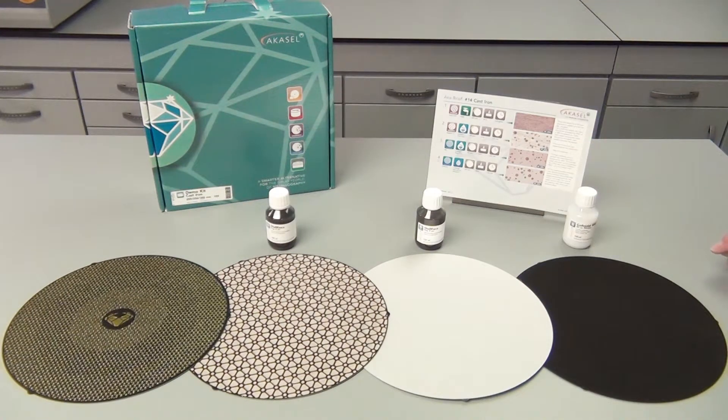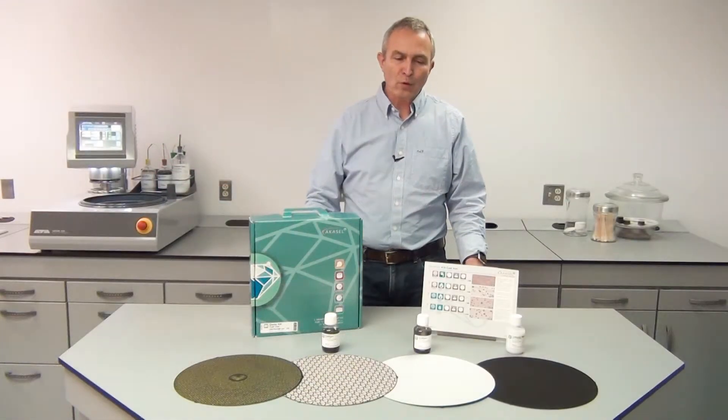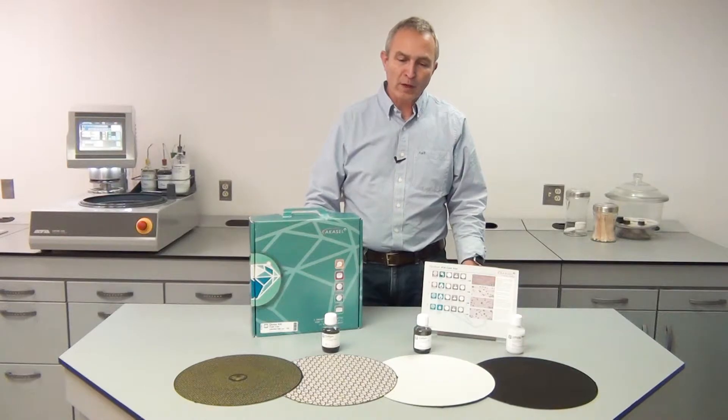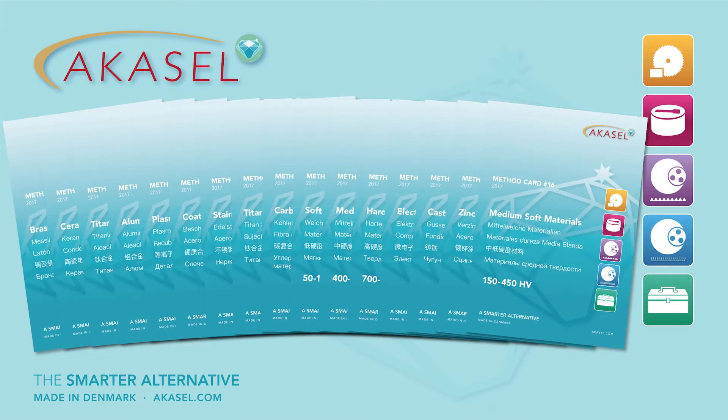The demo kit is available in three different sizes: 200, 250 and 300 millimeters. This was an overview of the contents of one of our demo kits. They are available for many different materials and you can see a list of all the materials available on our website, or you can contact your local dealer.